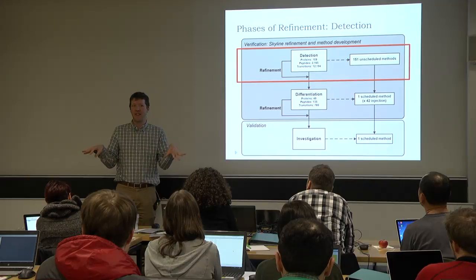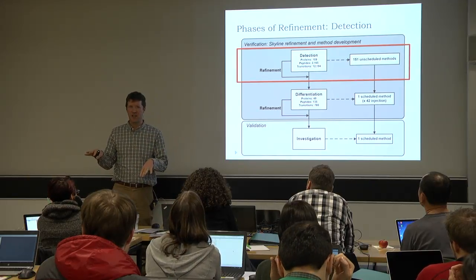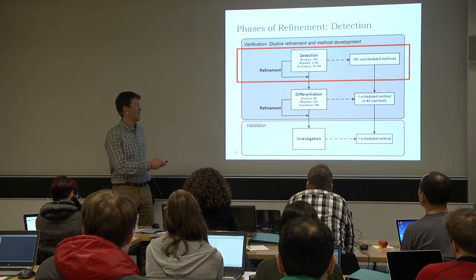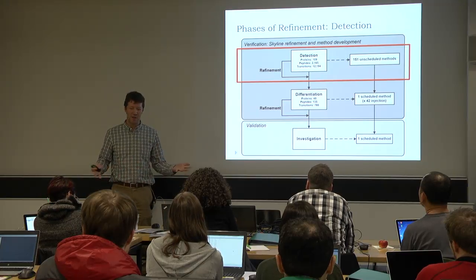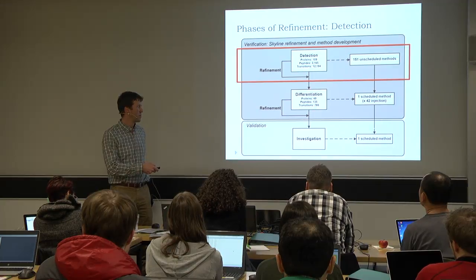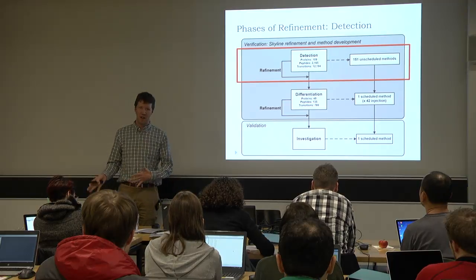I mean, some of these things, even though we think we can detect them, we'll see no differentiation. And so then we wouldn't go buy synthetics for those. But there are going to be some that become our high-value candidates that go into the next phase. And that would be this validation phase where we would get much more serious about our quantification and validation and making sure that we're actually measuring exactly the right thing.